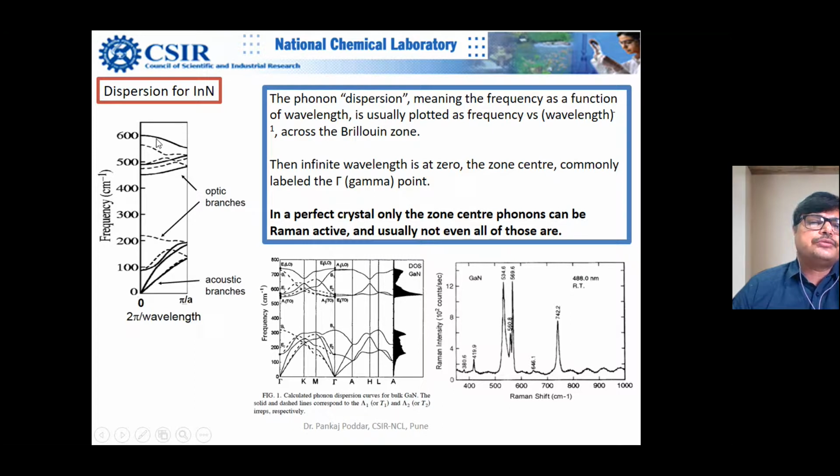So wherever this curve meets the K equal to zero line, which is this line, those Raman shifts only you record in Raman, those vibrating states. For example, you will see this point which is around 80, and you will also see something around 450. This you can see here, 419 exactly. Similarly, you can find points around 550 or more. Yes, 500. So these lines are somewhere here.